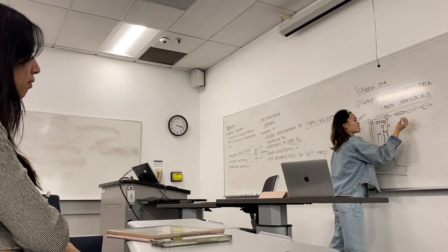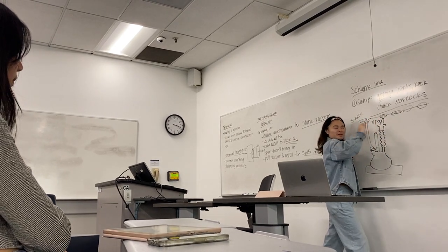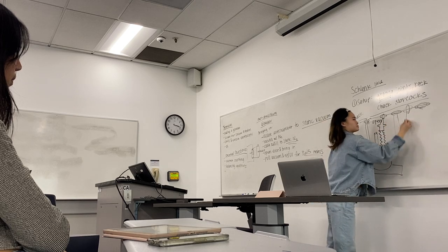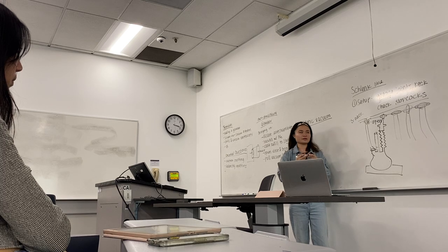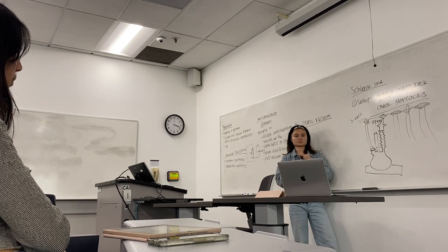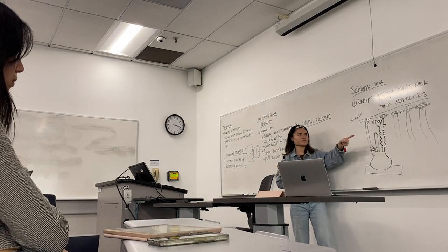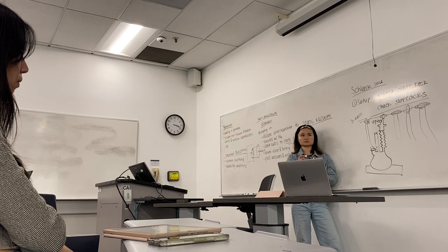So let's say this is closed. I'm drawing it closed as in a knob perpendicular to the actual line, right? And let's say one of them is open. Does anyone remember why we don't keep valves open if they're not attached to anything? Doesn't it decrease the flow from the one that you're intended to use? Let's say it's under vacuum, you can pull things up into the tubing.